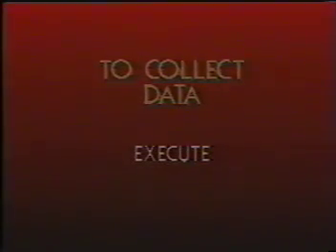When the sample label is accurate, you can deliver the appropriate sample to the FACS and press Execute to begin data collection.